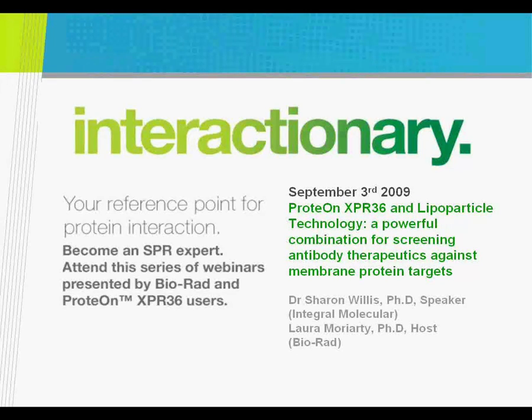Most of the time, non-specific binding is related to the protein or analyte that you're using, and the concentration that you use. It varies. I think it's a case-to-case scenario. If it's minor, it doesn't matter unless you're measuring high affinity antibodies. Then it can make quite a bit of difference. Or at the other end, when you've got a really low affinity, because that can make a difference too.